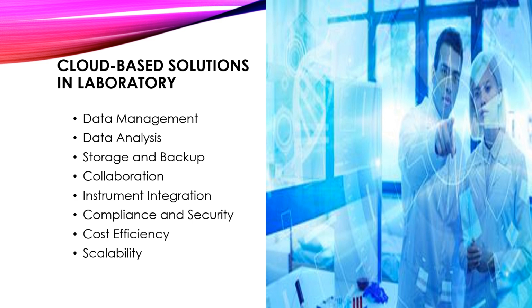Instrument integration. Now, some cloud-based solutions offer integration with laboratory instruments and equipment, allowing for automated data transfer and analysis. This integration streamlines experimental workflows and reduces manual data entry errors.